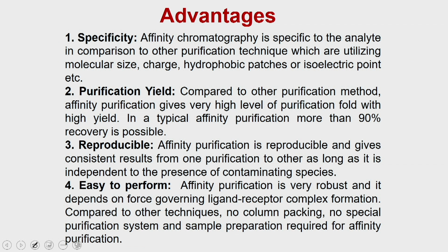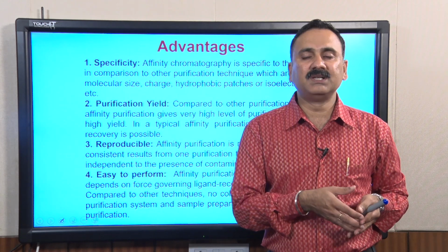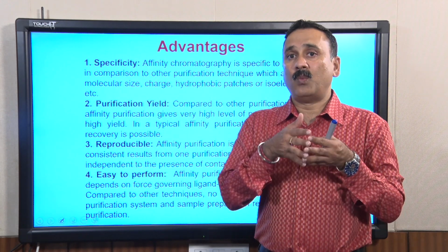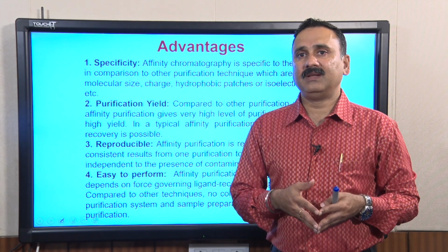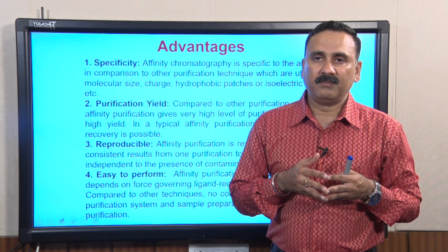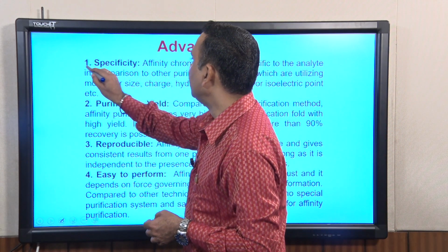Now, what are the advantages of affinity chromatography versus the earlier chromatography techniques we have discussed, like ion exchange chromatography, hydrophobic interaction chromatography, or gel filtration chromatography? One of the major advantages of affinity chromatography is that it is very specific. That will make the purification easier. So, it is very specific.